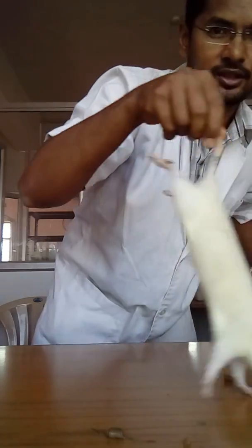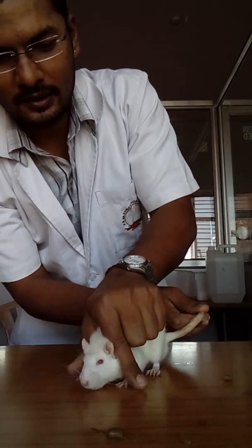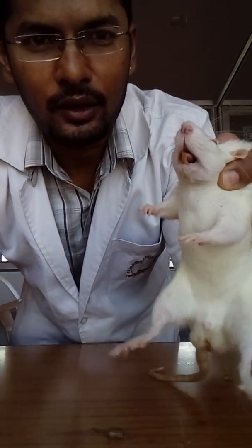Here I'm going to show you the way of holding the rat. We pull the skin from the ear side so that its mouth will get open — this is the way.